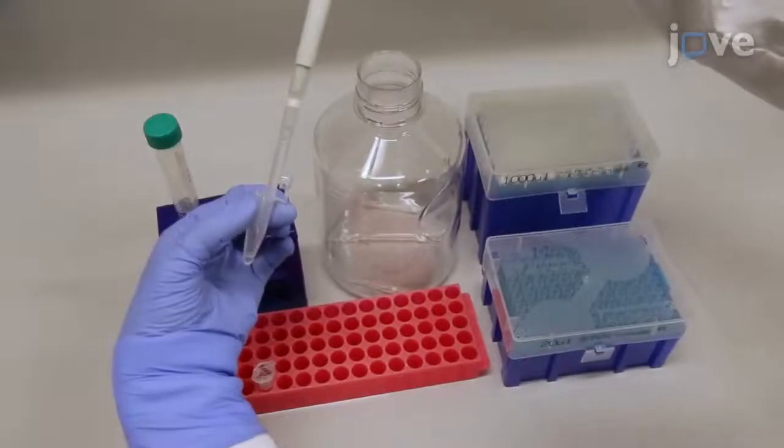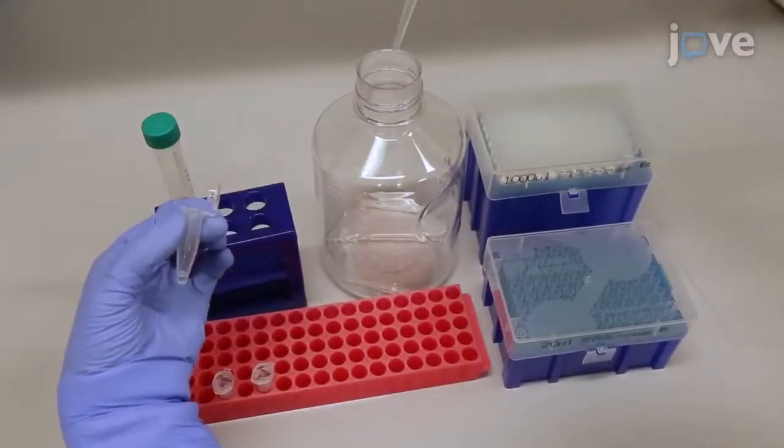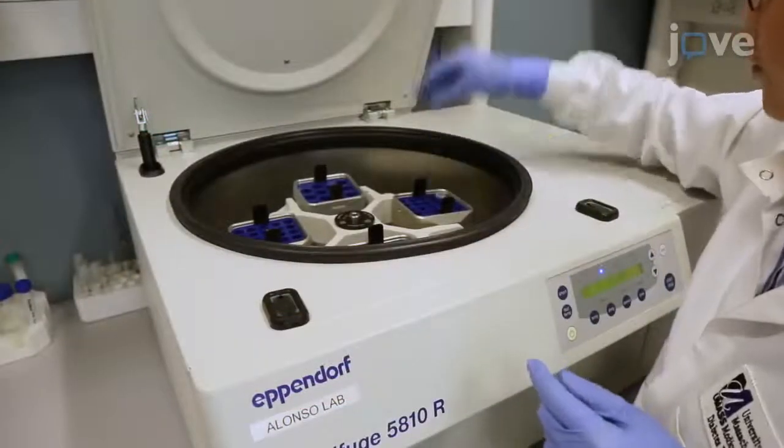Remove the supernatant. Repeat this entire PBS wash process for a total of 2 wash cycles.